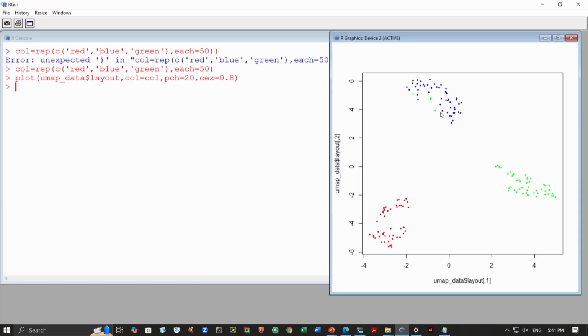So, this is something that we see, and what you also notice from our comparison with principal component analysis is that the separation is much larger here, right. This is because of the algorithm that is used. You can see these clusters are now very well separated and far away from each other, but also we see some green points within blue points. If you remember in PCA, and if you go back to that class, you will see that they were actually much closer in principal component analysis.